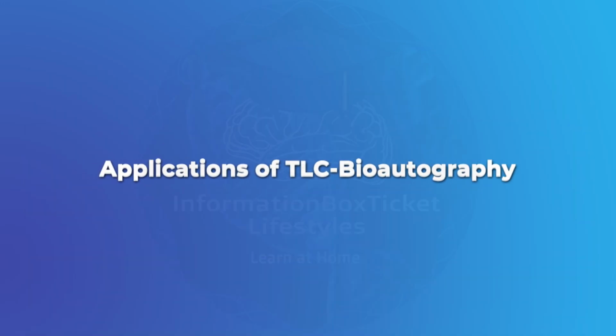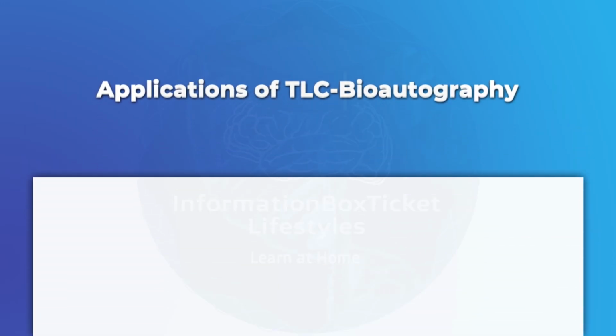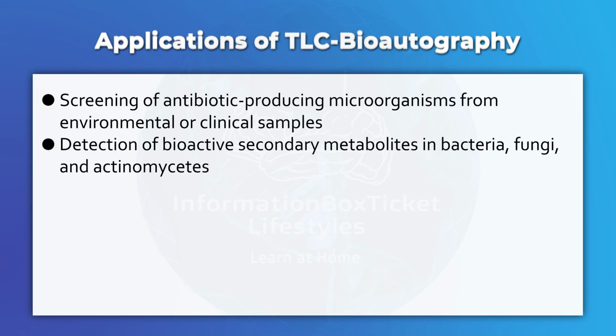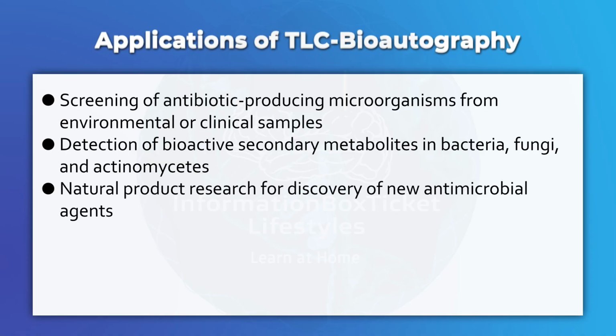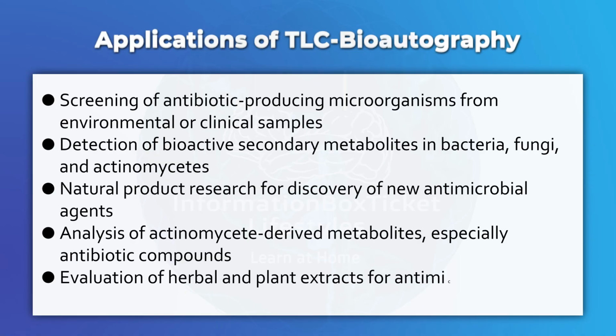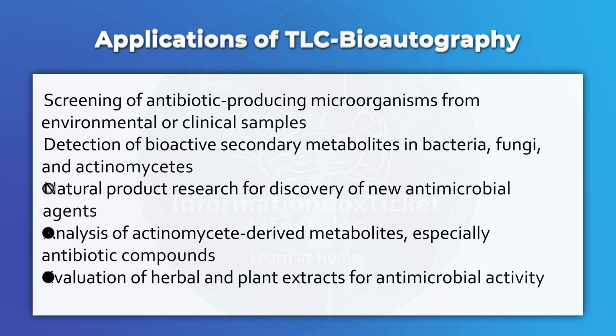Applications of TLC bioautography. Screening of antibiotic-producing microorganisms from environmental or clinical samples. Detection of bioactive secondary metabolites in bacteria, fungi, and actinomycetes. Natural product research for discovery of new antimicrobial agents. Analysis of actinomycete-derived metabolites, especially antibiotic compounds. Evaluation of herbal and plant extracts for antimicrobial activity.